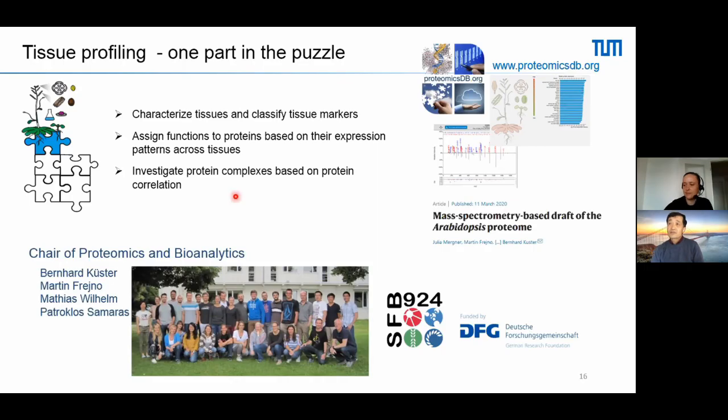The first question is: for quantitative normalization, how was it done? Did you use a pooled universal control sample? No, it's all label-free data, and we use the same input amount, and then we performed a total sum normalization of the samples.